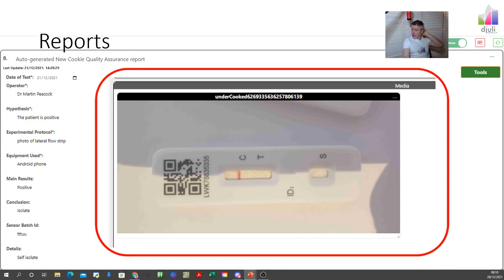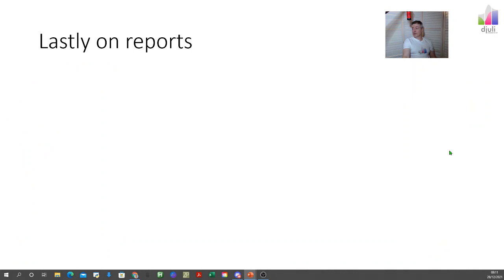you can also put images up there. Now, I'm not going to dive into the toolbar. That's really for a more detailed discussion about what to do with data within, let's say, djuli. But today we're really talking about unlocking the ENV, the experimental network value. But there is a whole toolbar there as well.